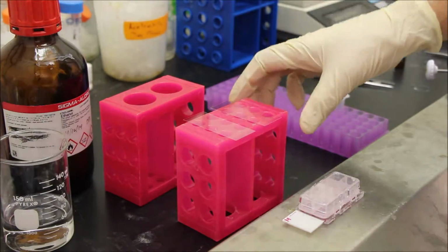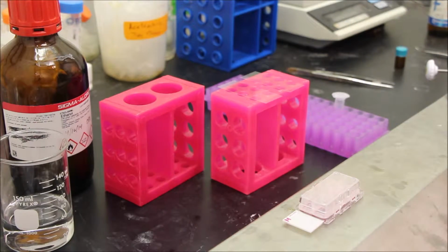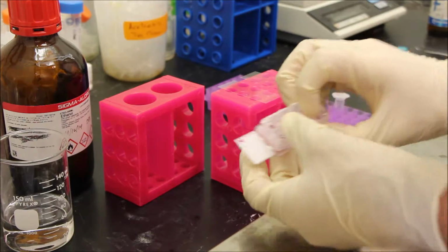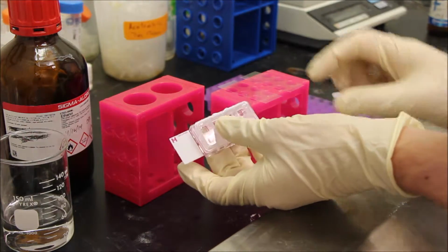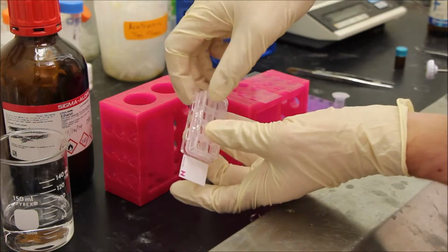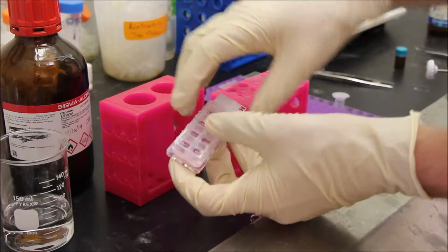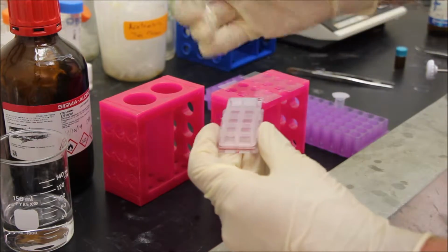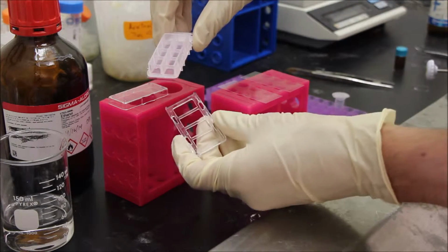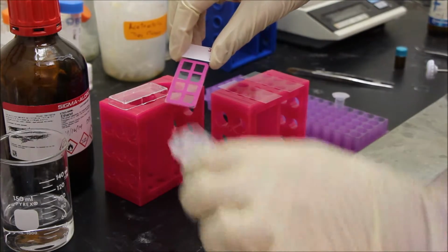So while that polymer solution, or monomer solution, is degassing, I want to show you the media chamber that we'll be using. So this is the Millipore EZ Slide. I've taken them off already, but when you first open it, there's 4 tabs, 2 on one side, 2 on the other side. You can just break them off. And when you do, here's the lid. The bottom holder will come off, and the media chamber will come off.